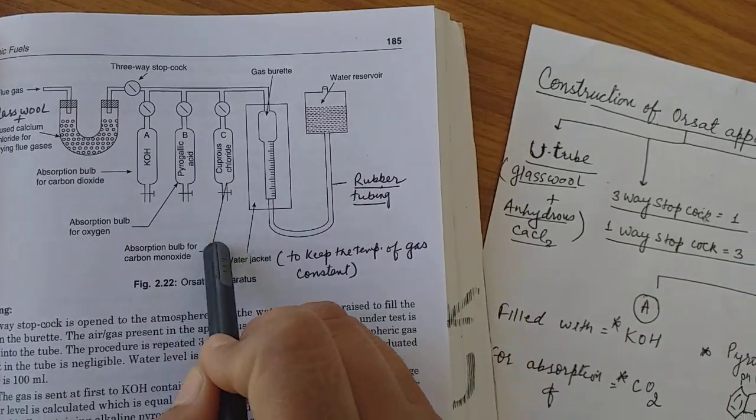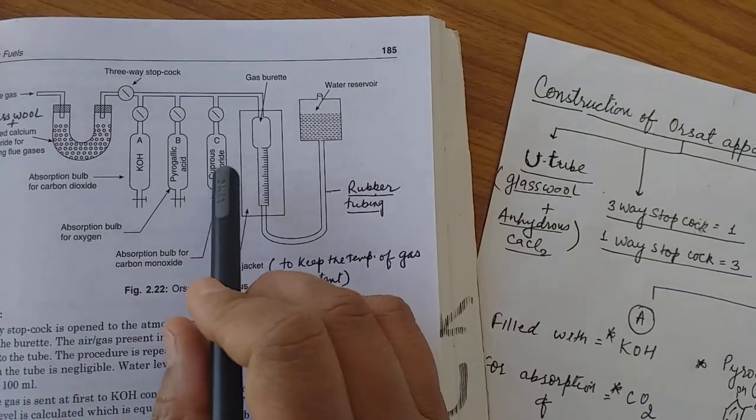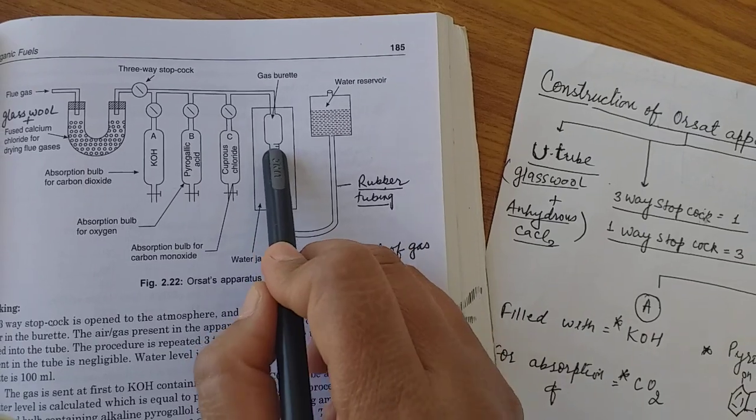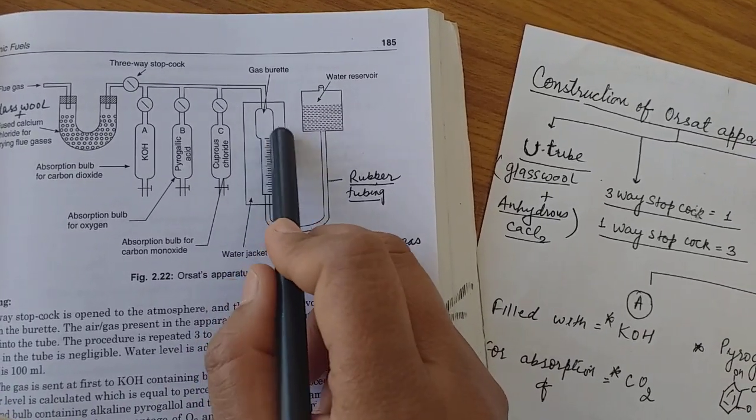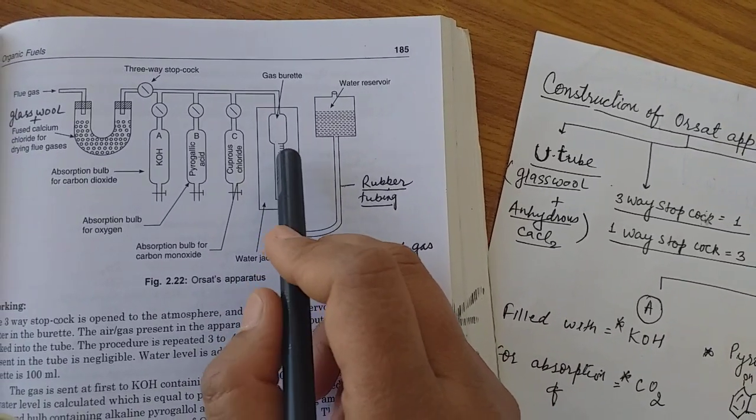After that, it is coming to the third bulb which contains cuprous chloride. Cuprous chloride absorbs the carbon monoxide, and after absorbing carbon monoxide, there is again we will note the level of the water which is decreased here.